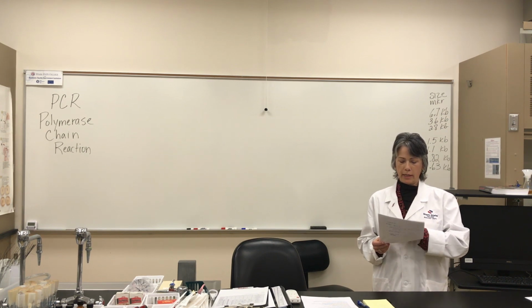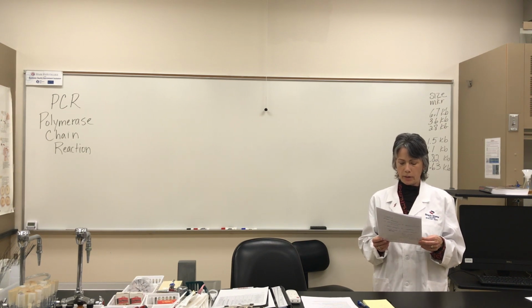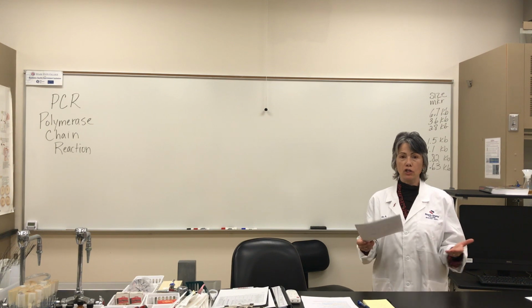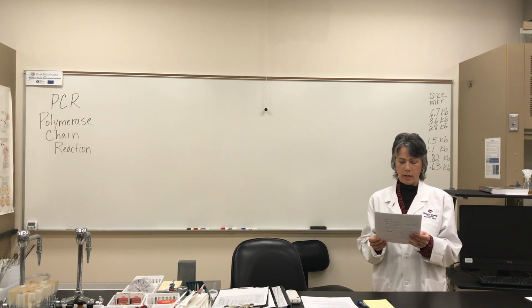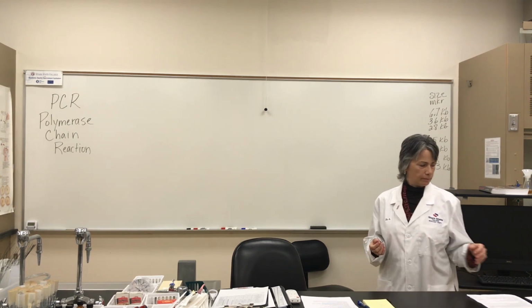We are going to use PCR to test those DNA samples for DNA sequences specific to E. coli Bad 1. So we can identify the source and shut down this outbreak. You would be working in groups for this, 3 to 4 students, each setting a couple PCR reactions. But now I'm going to go to the board and introduce you to PCR.